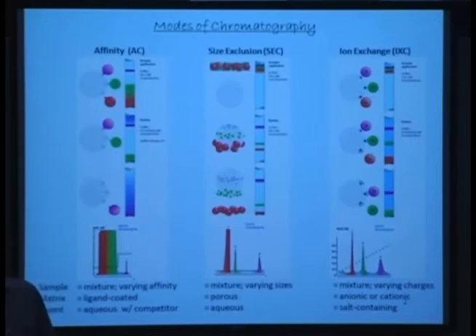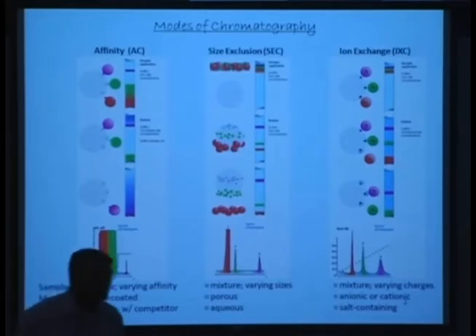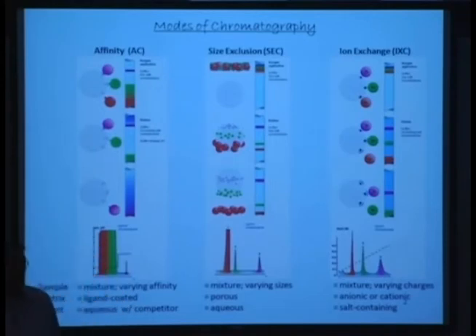So why would removing salts be a problem? If you're dealing with oligosaccharides and the size of the oligosaccharide is really small. Right, very good. So in essence, whatever Vimal was saying is absolutely correct. But the basis is that if you have to remove salt and the glycan is just about 3 or 4 residues, 5 residues, 6 residues, you're going to end up pretty close to 1,000. You're going to end up pretty close to 1 to 3,000.